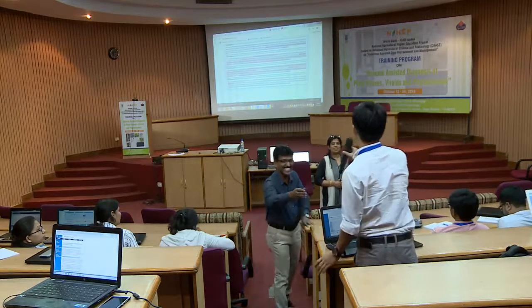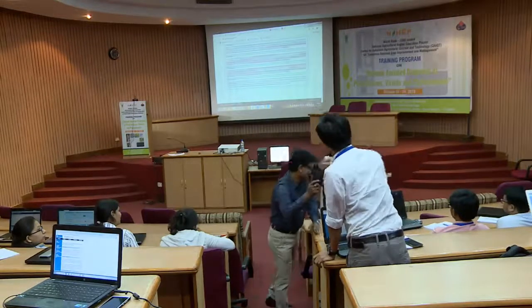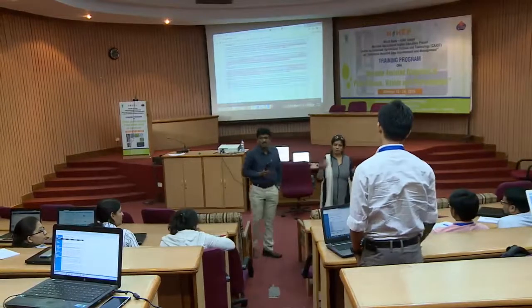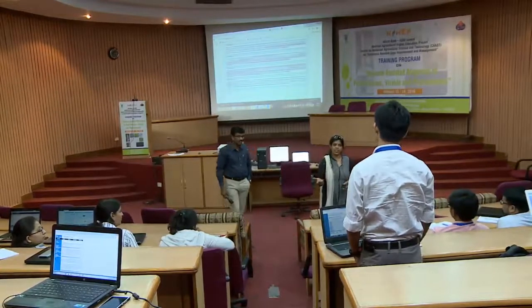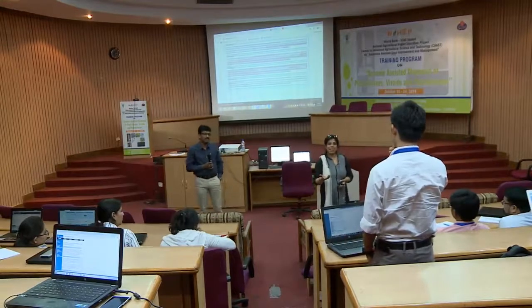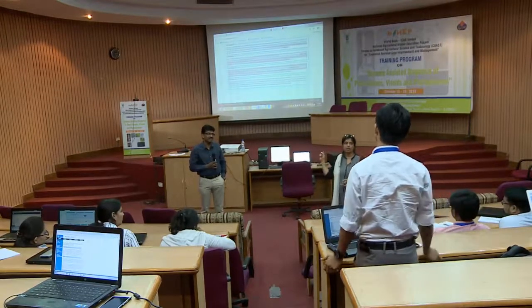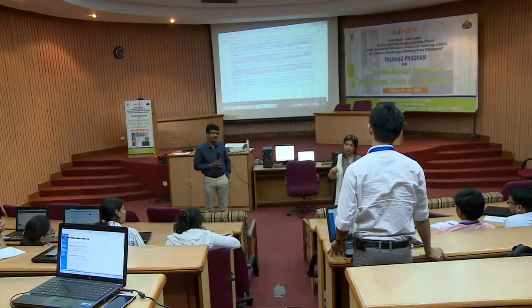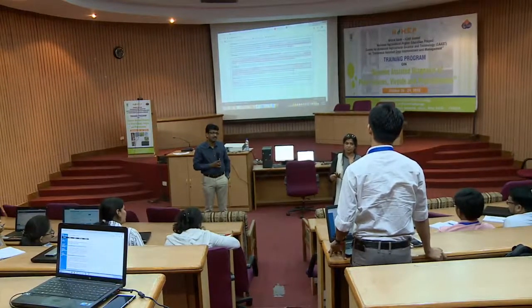While submitting the sequence, it depends on how honest you are in curating your sequence and sending it, because it is no one but we only who are sending the sequences, right? That's the reason earlier they were not asking for annotation and curation. Earlier whosoever wanted could submit the sequence like that only. But now, until and unless they verify the annotation and the CDS, they don't consider it.